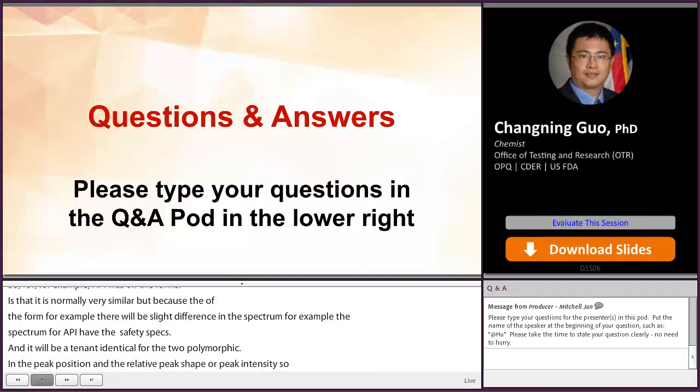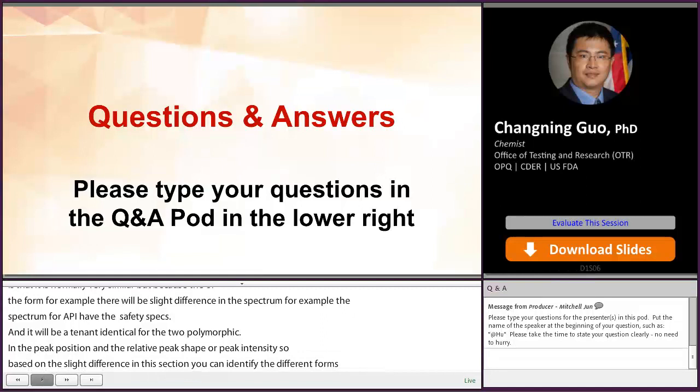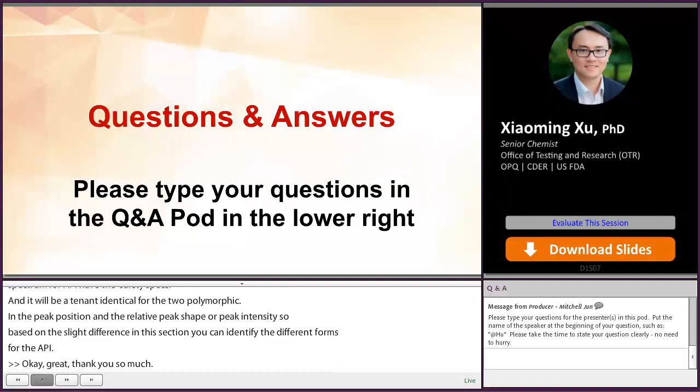Okay, great. Thank you so much. Our next question, we're going to go back to Dr. Xu, and I think we're going to be able to hear you much better now. Is it required to apply internal sonication for PSD measurement for flocculated suspension aggregate?